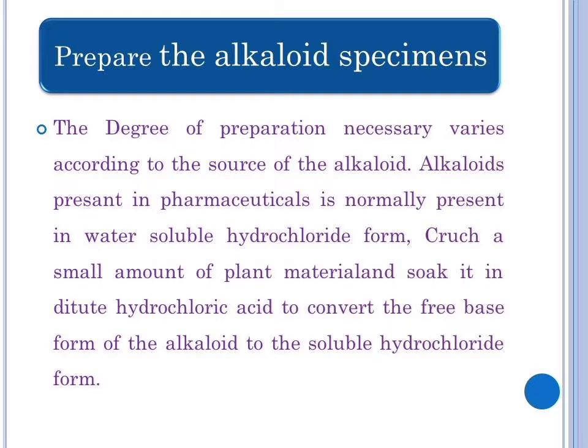For seeds, leaves, and other vegetable specimens, use a clean stirring rod or a spoon to crush each specimen thoroughly and transfer it to a tube. Add about 3 ml of distilled or deionized water and about 0.25 ml of 6.6 M hydrochloric acid to the tube and swirl to mix the contents.